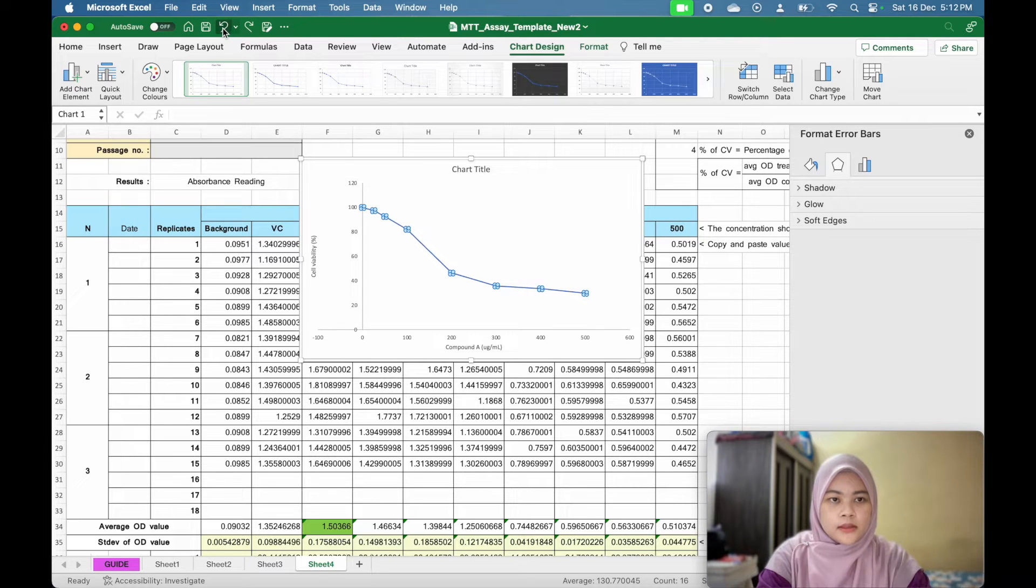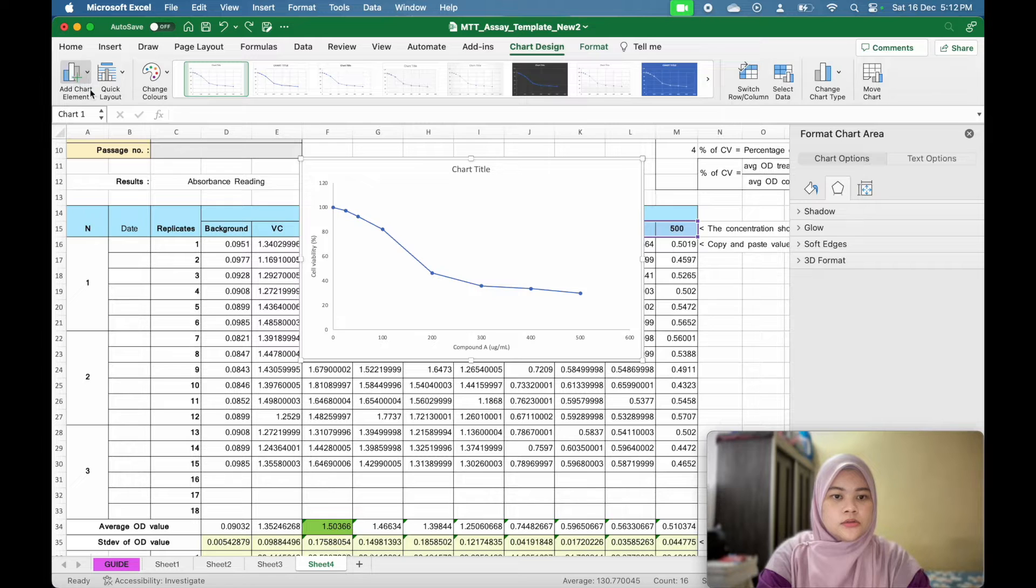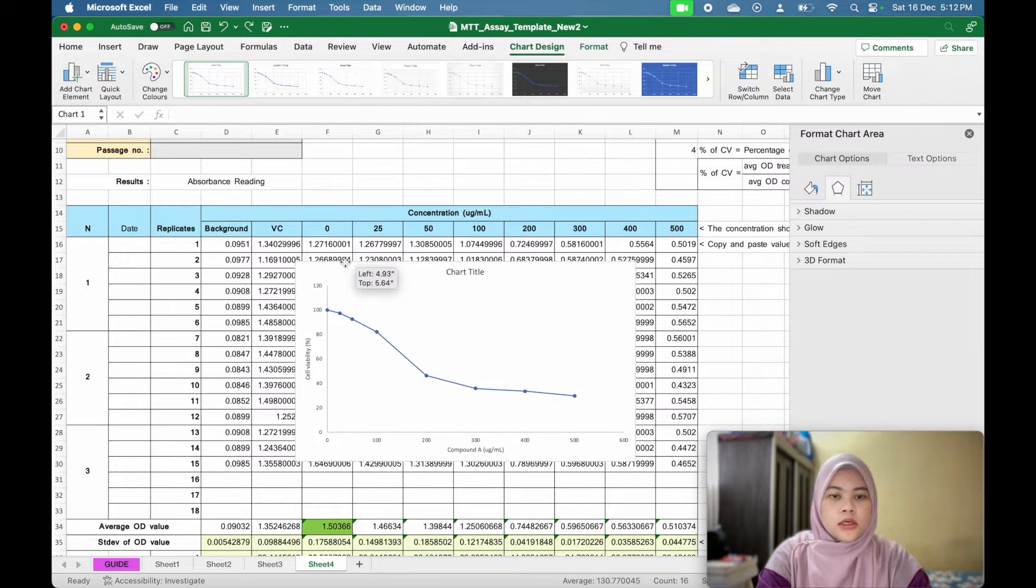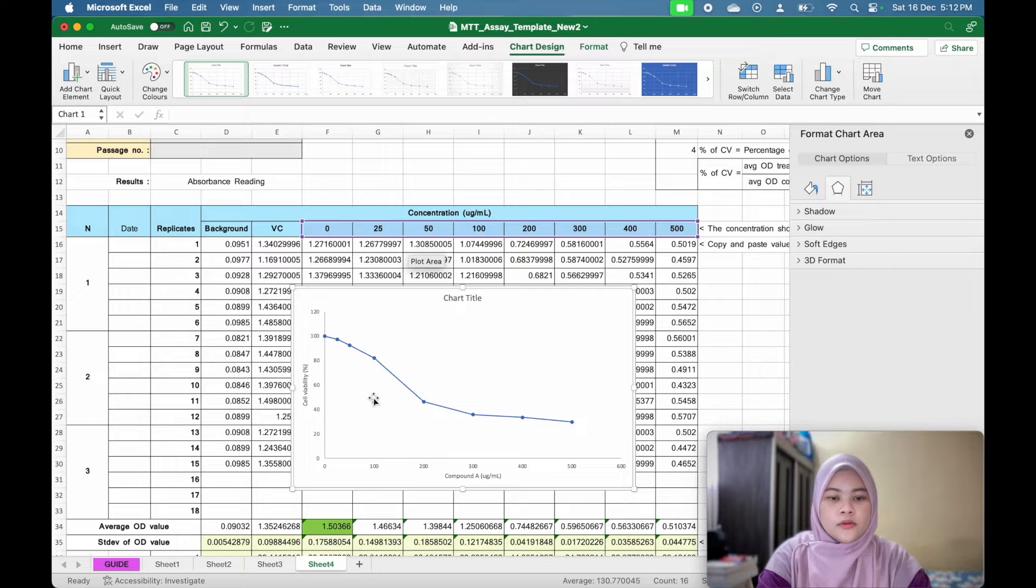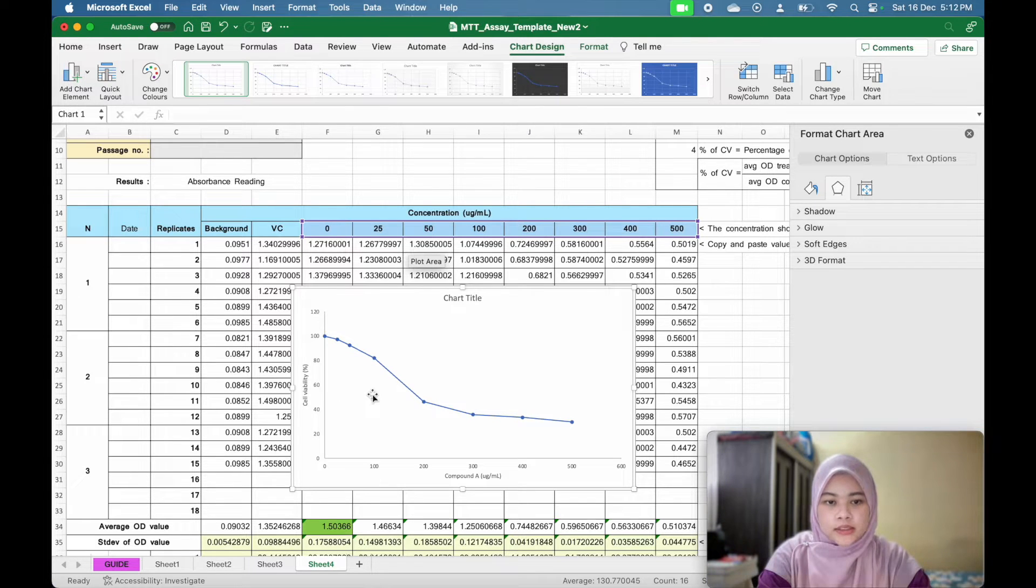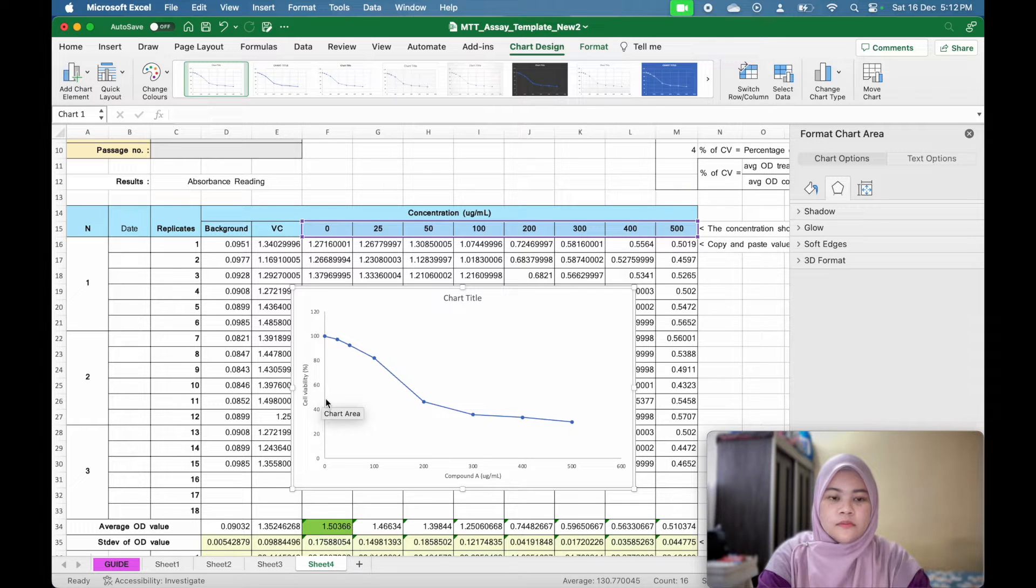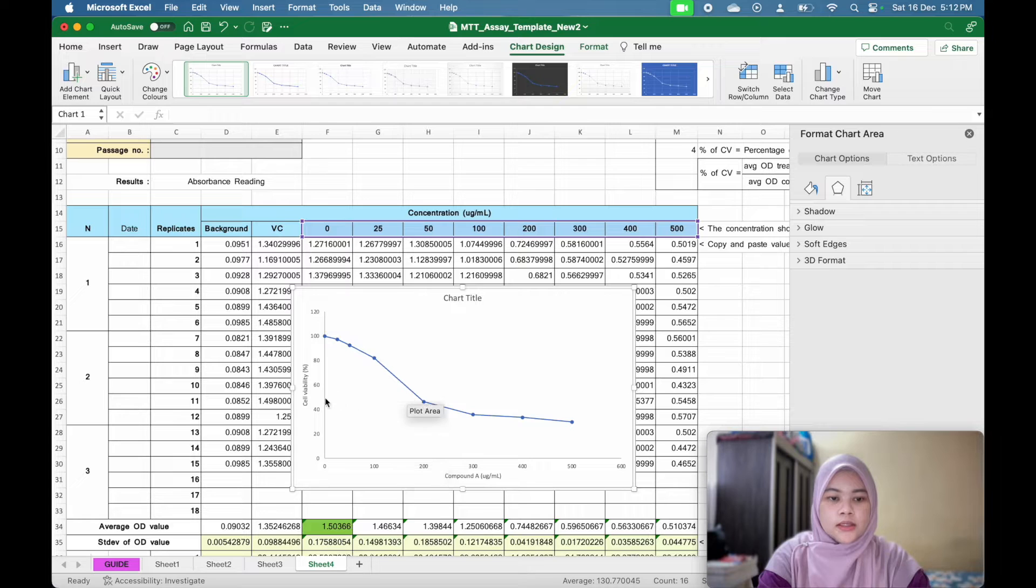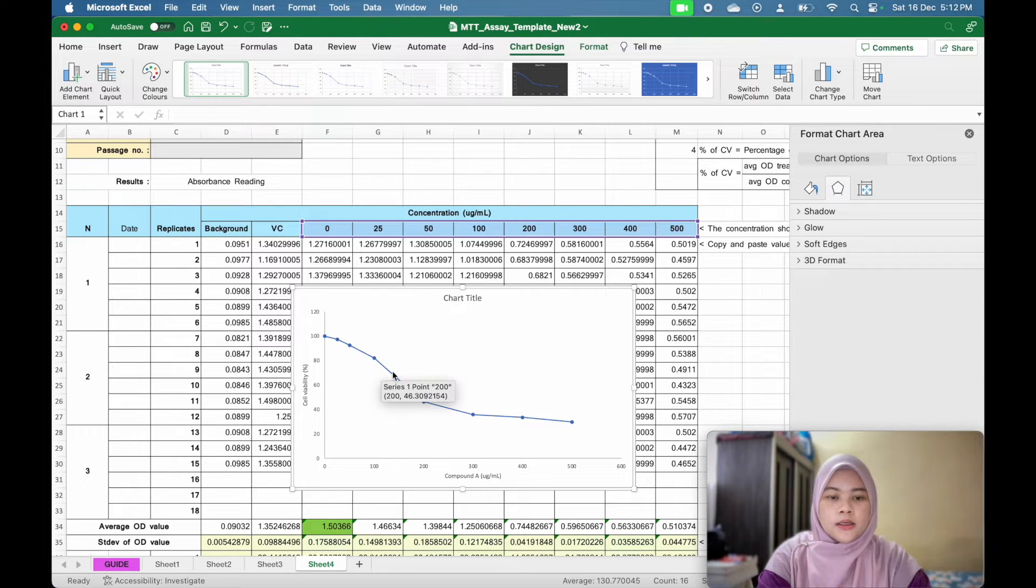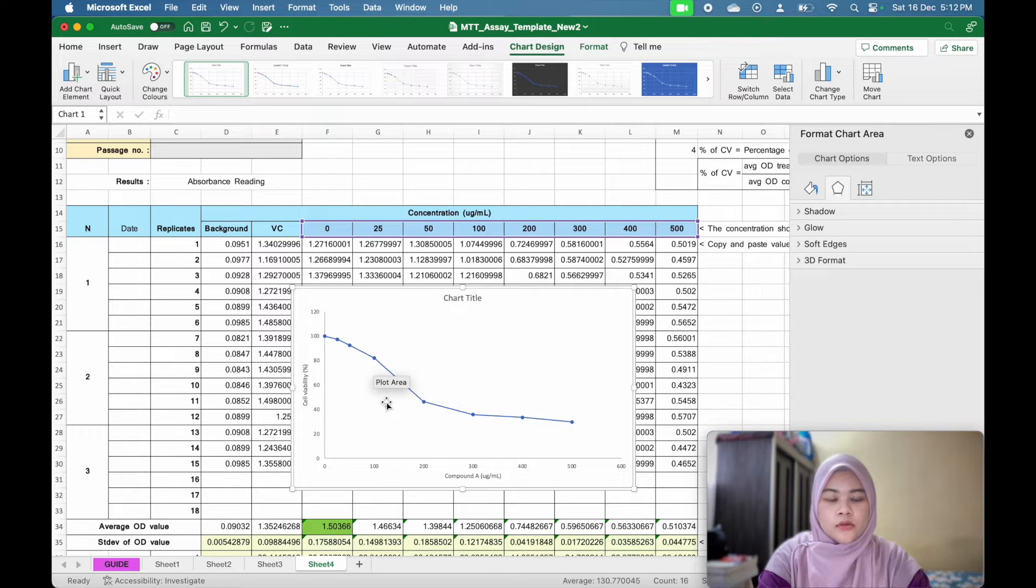To find IC50, you need to know that you want to predict the IC50. So you need to know that at 50% viability, what are the concentration of compound A is needed. So you can do that by using the linear equation of this graph, which is Y equal to MX plus C.